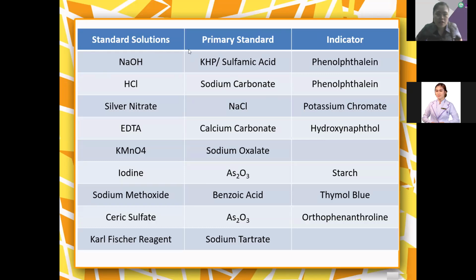So just like when you say sodium hydroxide is widely used in the laboratory. It's cheap, it's very common. There are a lot of laboratory procedures that use sodium hydroxide. So it's very important also for us to know the concentration of this substance. And then another thing, sodium hydroxide is hygroscopic.